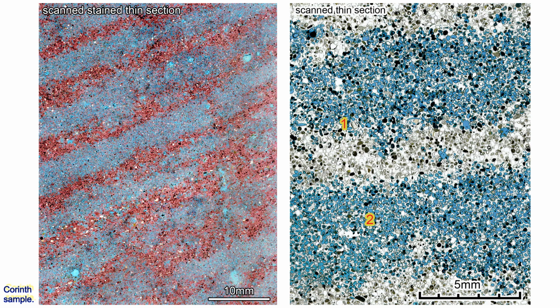On the right, the higher magnification and unstained image shows two blue lamina dominated by blue epoxy-filled oomoles that alternate with lamina composed of both calcite ooids and calcite-filled intergranular pores. The margin of most lamina are diffuse and irregular, emphasizing the diagenetic origin of these lamina.